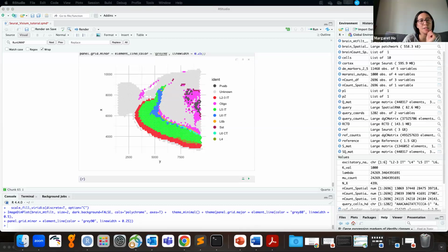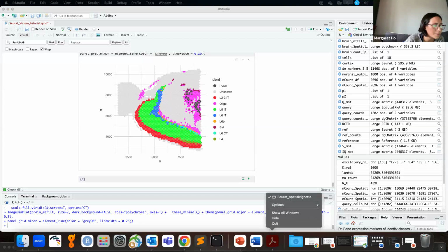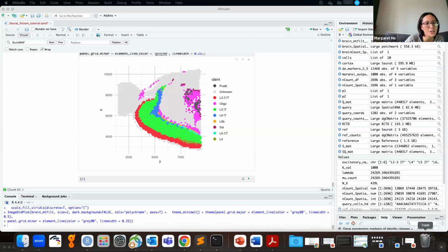I chose this one because, well, I actually don't know all the details for all of these deconvolution steps, but there are other alternatives. If you didn't want to do RCTD, there's something called cell2location, and a bunch of other alternative methods for doing that as well. There's a slide in part one that talks about different deconvolution methods. You can look over there if you wanted to try other methods. I like RCTD because you can run it on both Visium data, Xenium data, etc.